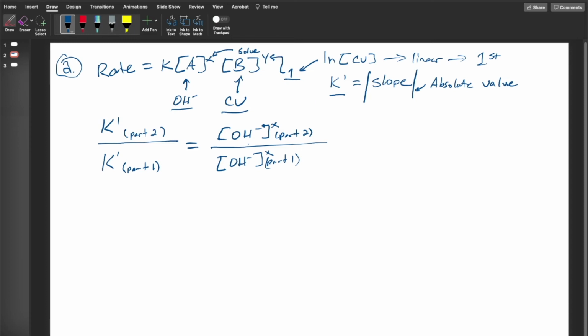right? Because you diluted those, right? And you did the dilution calculation in the previous question, right? Where you did the M1V1 equals M2V2 because you took 1 mL of that given solution of sodium hydroxide and you diluted it to 8 mL, right? So the numbers that should be going there are actually your diluted concentrations of sodium hydroxide.